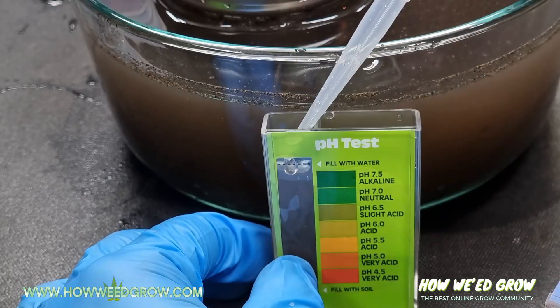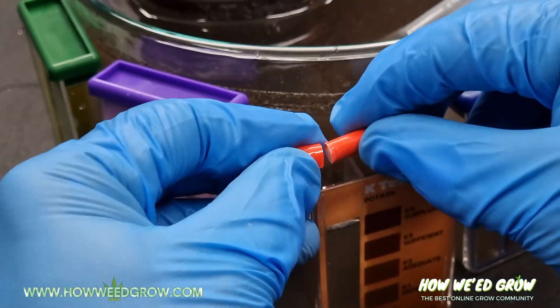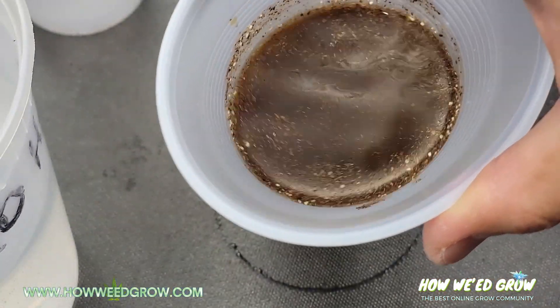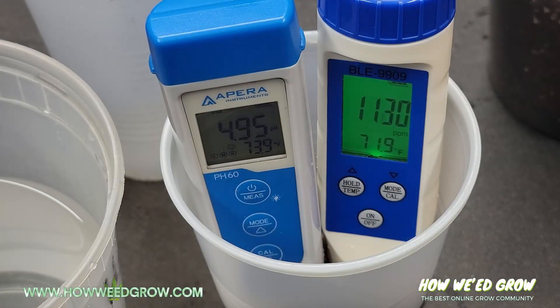It's also important to know the starting EC or PPM, which measures how much nutrients are in the soil. I'm going to show you how to do a soil slurry test, which measures your soil's pH and PPM, which you can balance before you start using your soil.